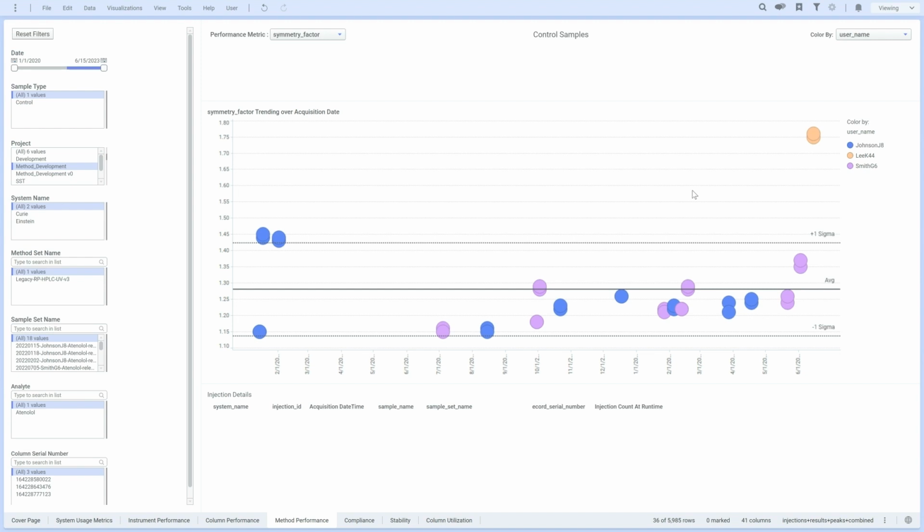Leveraging the Tetra Scientific Data Cloud to build a method performance dashboard enables a streamlined analysis of key parameters, eliminating the need for manual referencing of old COAs, batch records, inventory spreadsheets, or other systems.